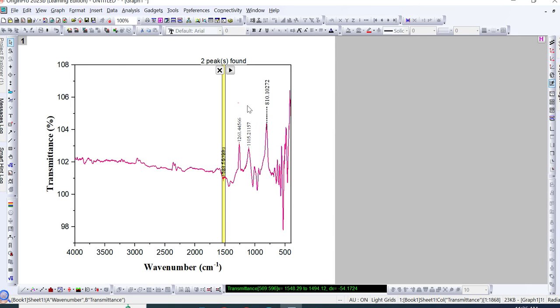You can also copy and paste this line from here, by selecting it and pressing Ctrl C, and then after that pressing Ctrl V, this line has been pasted. You need to move this value to the point above, and then place this line at this peak so that you can directly link this value to this.